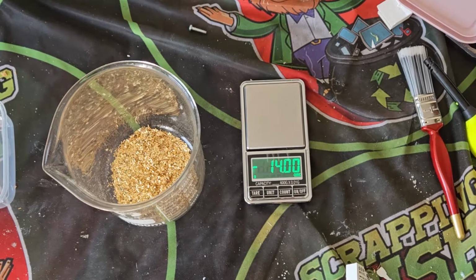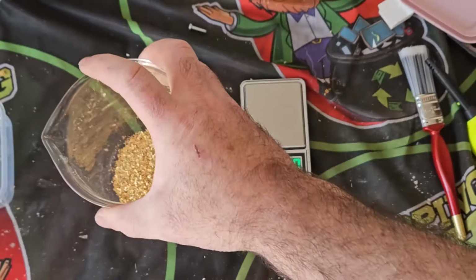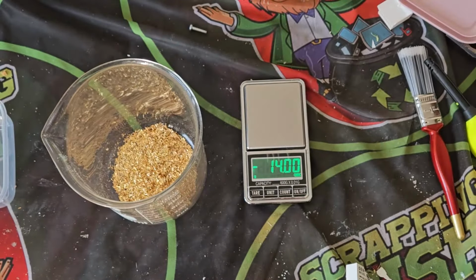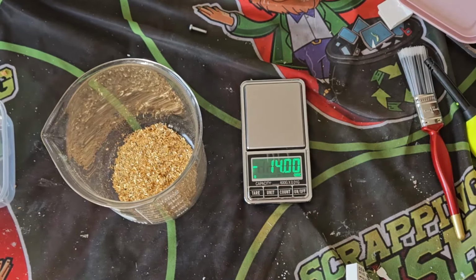So again, as I was saying, this is for people who can't get nitric acid and wanted to know what other way there is to dissolve the gold flakes into a solution and then get gold powder back at the end. Well, this is the way I do it. I use bleach as an alternative to the nitric acid. So it'd just be hydrochloric with bleach, and that's it. There's no need for nitric acid.